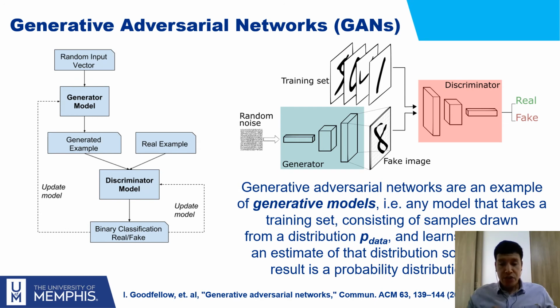Although the results with the convolutional autoencoder are better than those that can be obtained by the traditional method in experimental conditions, we still wanted to test these deep learning models a little bit further. In this case, we tested a generative adversarial neural network, a GAN model. First, an introduction to this kind of model.